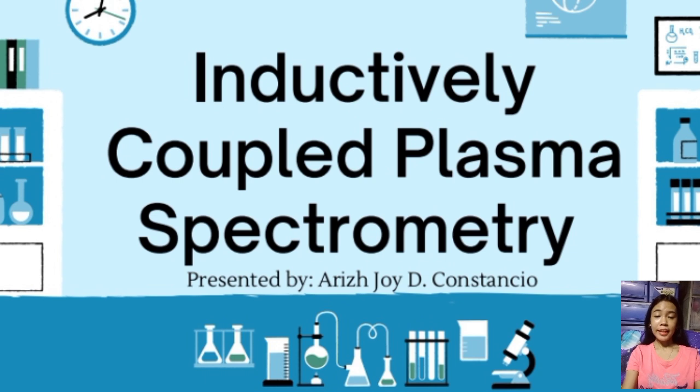Our topic for today is inductively coupled plasma spectrometry. Let's start our topic.